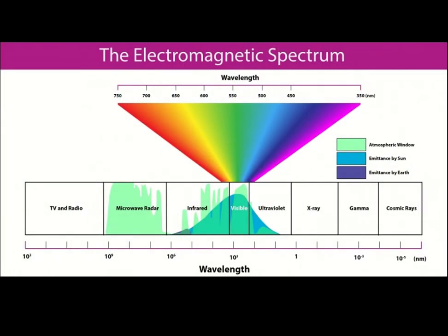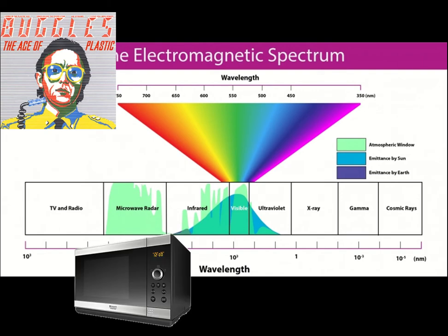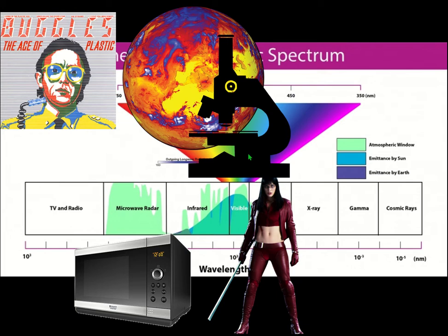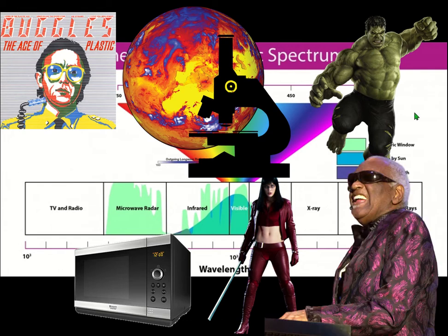So this is using X-rays. So you have radio waves, microwaves, infrared waves. That's what you get heat things from. You know, the visible light, which is what we use in our microscopes. Ultraviolet, which was a very horrible movie, which I would recommend you never ever watch. And X-rays. So X-rays are here, and you have gamma rays, which turned the Hulk into Hulk, and you have cosmic rays. This is the most appropriate image I could find for a cosmic ray.